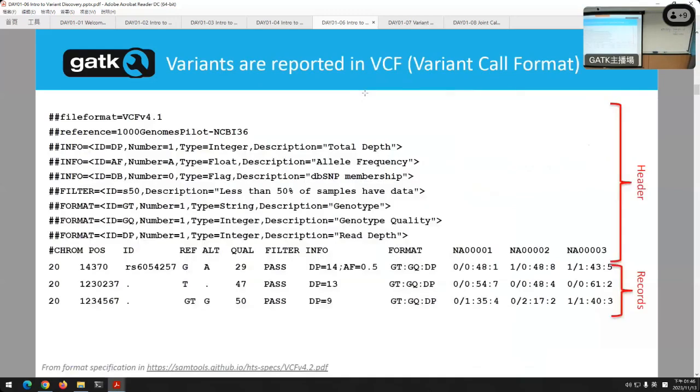Someone had asked about how we represent variants, so here's the answer. We will go into more detail later. I think Aaron's going to cover some of this also, so I'm just going to keep it high level.